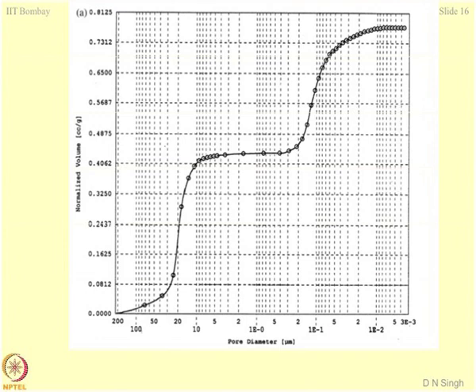This is the resistance offered by the system and this is the resistance offered by the system. So you can very easily make out that this is the range in which the pores are present in the soil mass or a porous system. This is how you can diagnose what type of pores and their frequency, their magnitude and their diameters are present in the system. Present day MIPs have software included in them, so they analyze everything for you based on the curves which you normally get by doing an experiment.